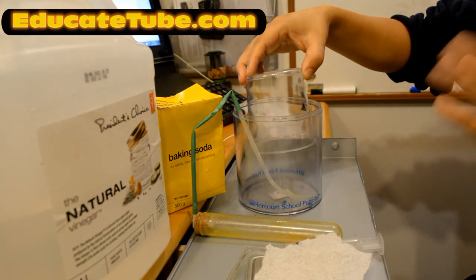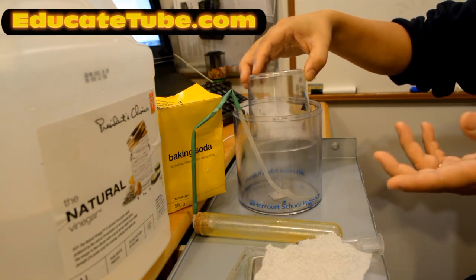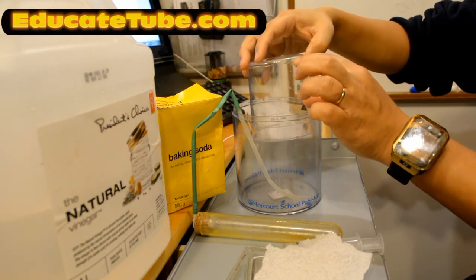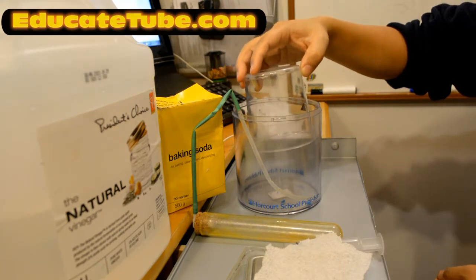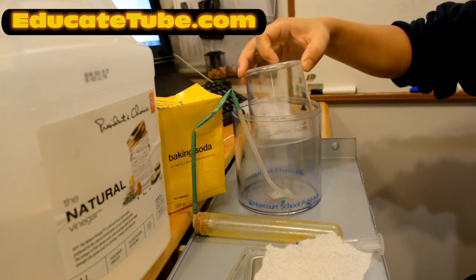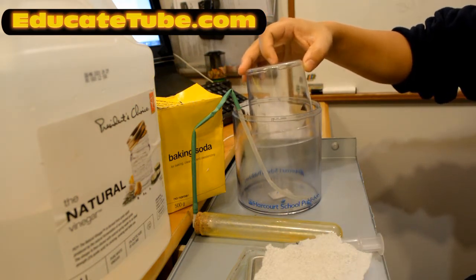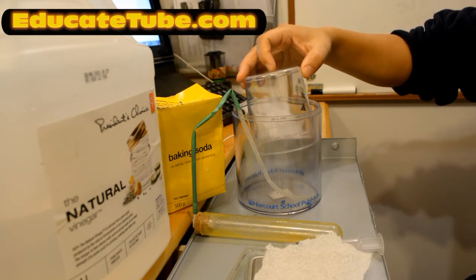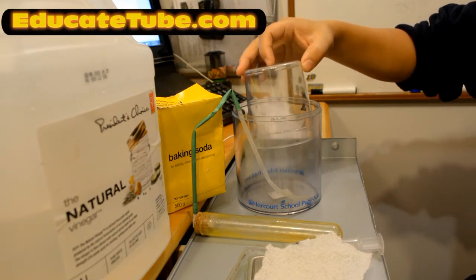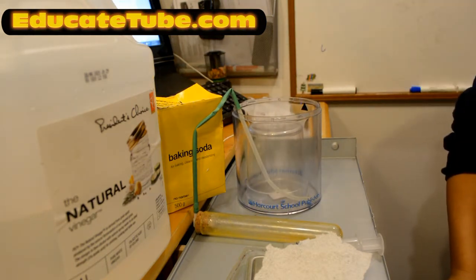Now, of course, I did not compensate for the water vapor pressure, which I might do for calculation. You have to account for that whenever you displace gas in water, because there's some water vapor pressure involved. Probably a minute amount, maybe a few percent. So if I don't include it in this reaction, we can assume there's going to be some percentage error. But whatever it is, we're hoping to get around 260 to 290 milliliters, at least that much. But we should still get at least a 90% yield, I hope.